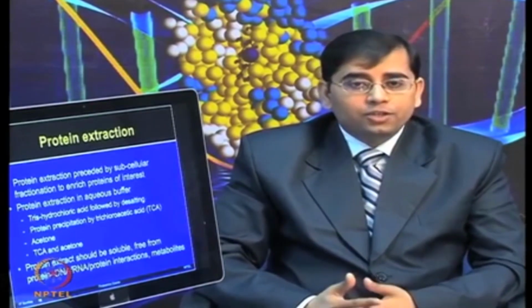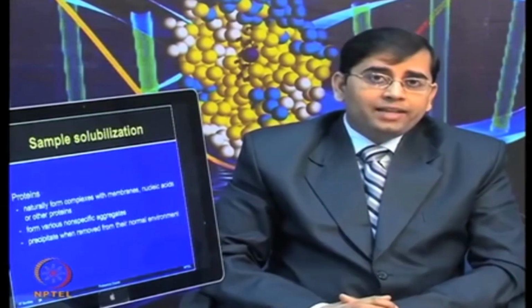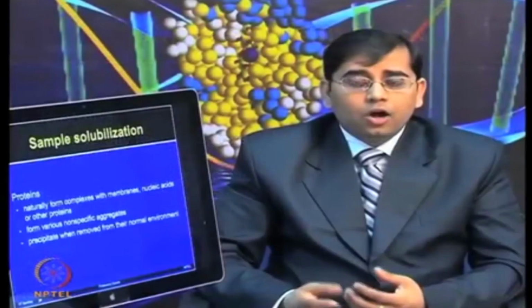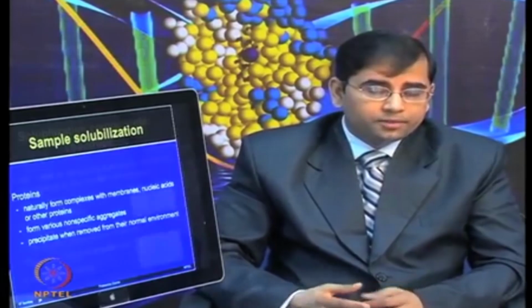No metabolites should interfere in your protein extract. Sample solubilization is important because proteins naturally form complexes with membranes, nucleic acids as well as other proteins. So, to avoid all of these issues, sample solubilization is very important.